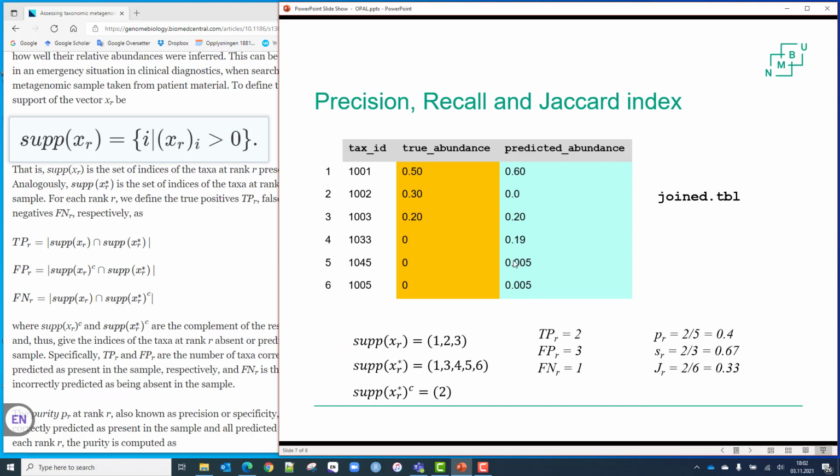I mean, these are very small values. I would say that when you have these low abundances, these taxa are hardly present in my data. This could easily be due to some noise here, right? The reads have been misclassified into these 2 taxa. A few reads, right? Few reads only. So when the abundances are this low, I could easily call this absent.